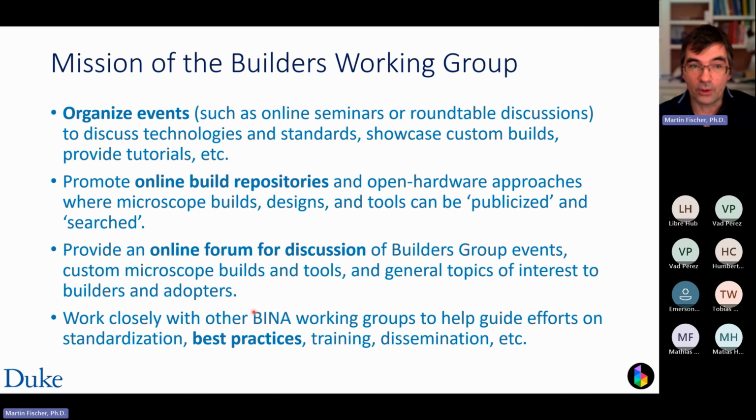So I'm going to go through some of those things. I'm going to talk to you a little bit more about events, what kind of events we're planning to organize. I'm going to talk to you about the build repository, which is actually existing. The newly established online discussion forum that is associated with the Builders Group, and our efforts to come up with a best practices document to sort of standardize these procedures a little bit.